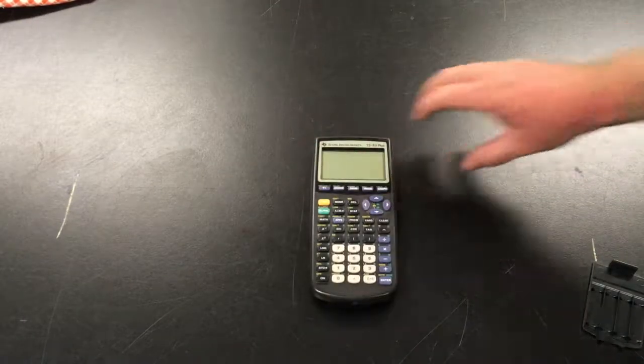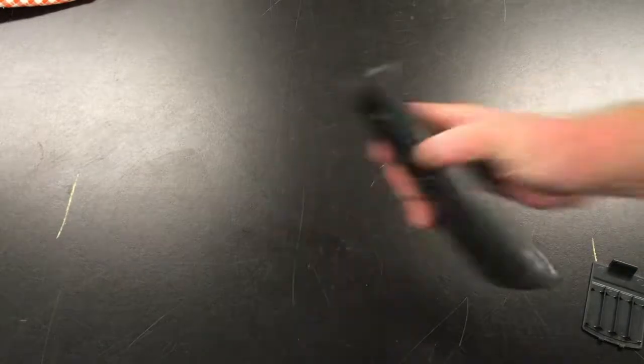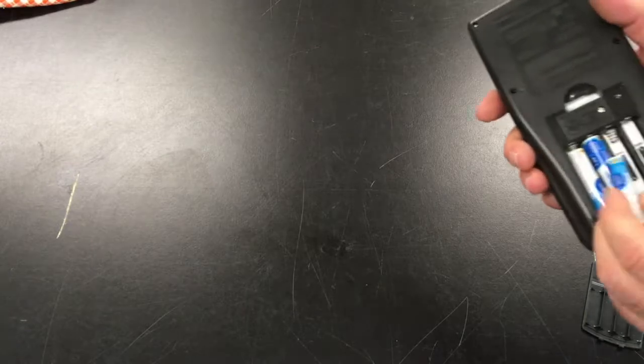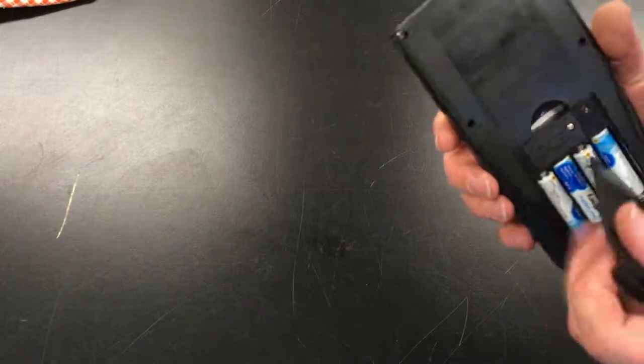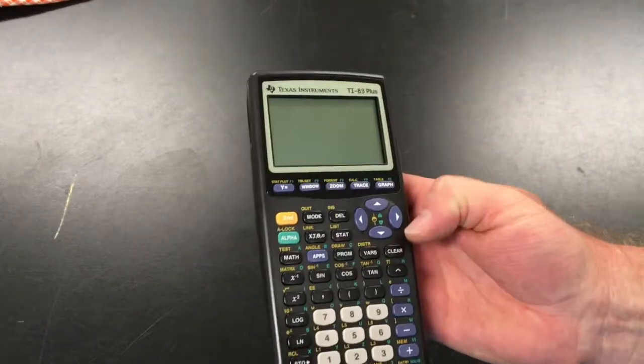Okay, so putting together a data logger, we have the graphics calculator, and this one uses AAA batteries, so just make sure they're in the right way. Make sure you take the batteries out after you're finished with the experiment, otherwise they'll corrode in there and get damaged. That back on, turn it over, and you've got your on switch up here.